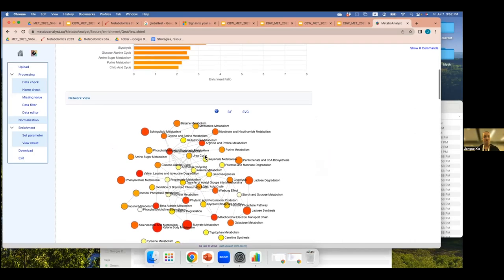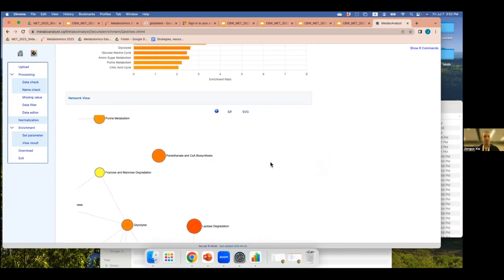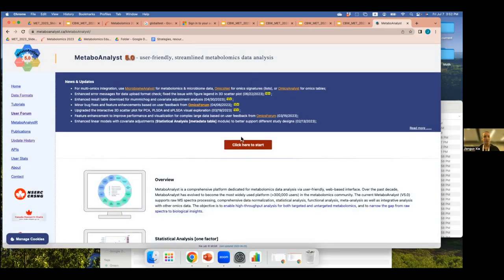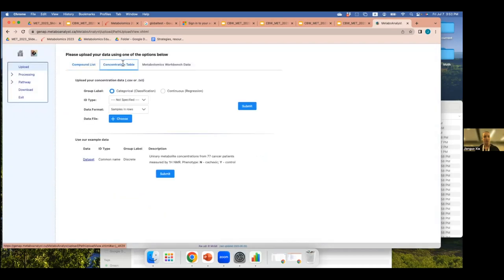If you're used to gene expression data like transcriptomics where you have many well-annotated features, metabolomics is a different story. For the lab, you can take your concentration tables, upload them here, play around with the tools, and ask the TAs any questions to try and get it working.